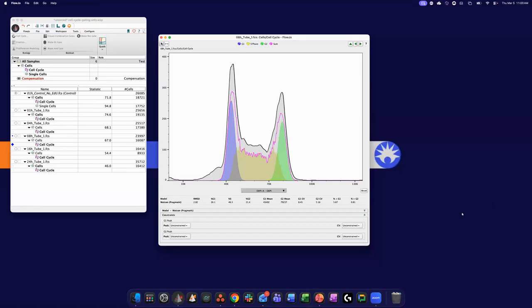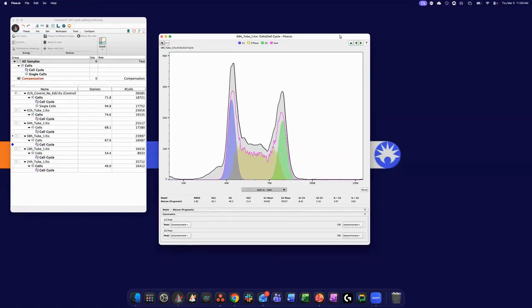And then the follow-up question was, if your cell cycle distribution isn't what the literature shows, is that okay? It depends on the biology. If you have a reason to justify distributions in the equilibrium, then I suppose it could be valid. But if it's just a standard cell cycle assay on a well-established cell line and you're not seeing what you see in the literature, I'd start to think about my sample preparation and whether I've achieved saturation of that dye.